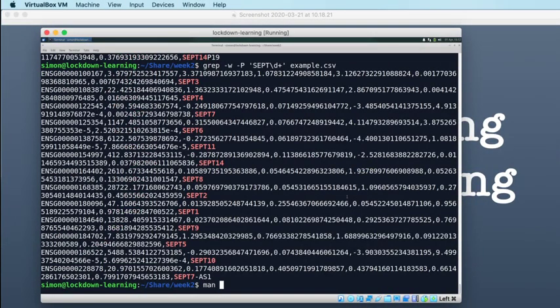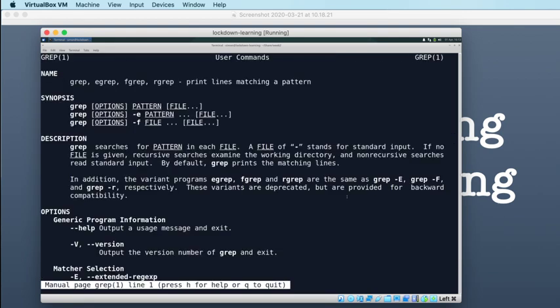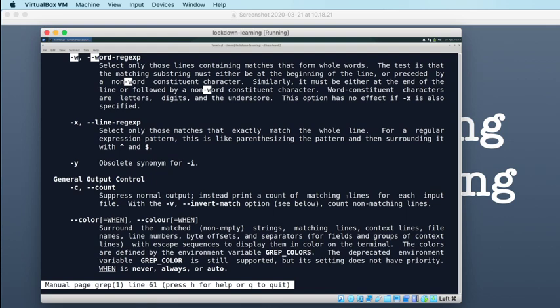Let's type man grep, and then man returns the text of the manual in a pager application, and less, which is usually the pager application that's used, allows you to search in the text that it's displaying by typing a /, and then some text that you want to search for. So I want to search for -w to see if we can find the matching word argument, and see if it tells us what the word boundary characters are. Here we are.